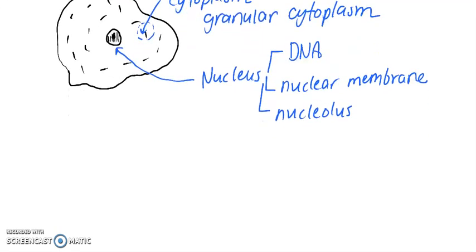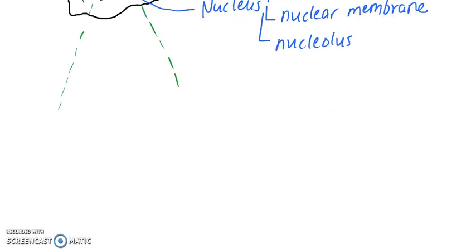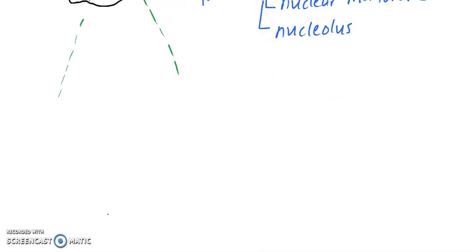Okay, so let me take my nucleus and blow it up to get an idea of what we're looking at. Let's use purple. So here is my nucleus.